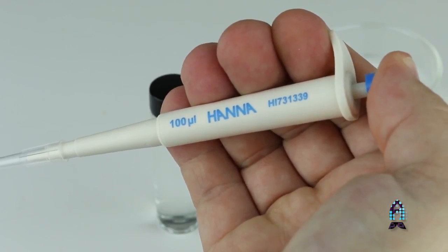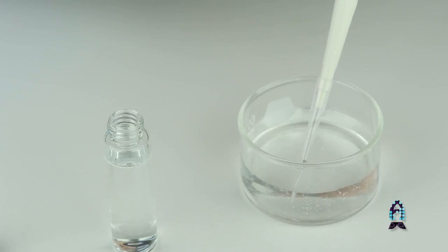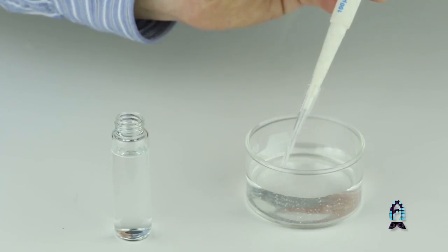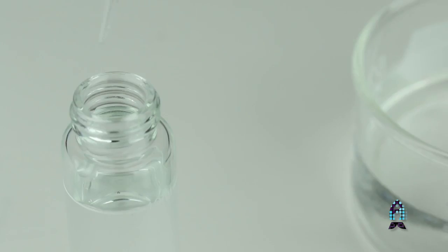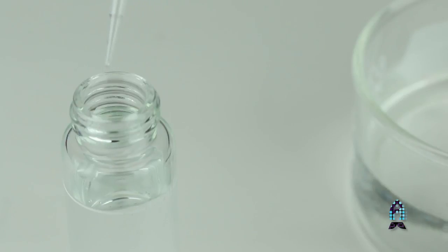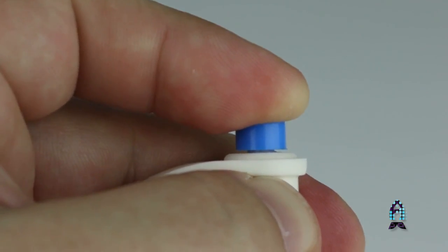It's really easy to use. Pretty much all the new checkers come with this. You just push down to the first stop and administer the tip into your saltwater sample, slowly lift up the plunger of the pipette, move over to the cuvette, and push down to the first stop and then the second stop to administer all that saltwater sample. This way you know exactly 0.1 mils are going to be used every time, and people have been getting a lot better results with our calcium checker because of it.